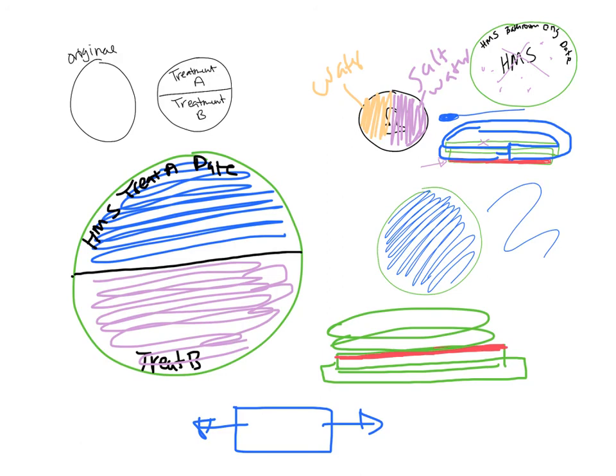So you just need to be careful with your plates, and they can get crushed in a bag, so you'll want to pay attention to those. But for bringing it home, if you don't have the parafilm, you'll just tape around it like you did bringing it to your house or to whatever environment you're going to.